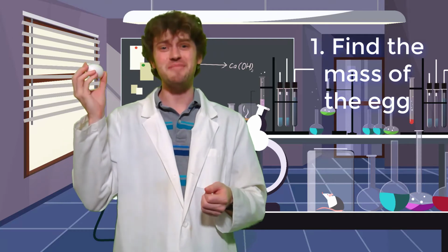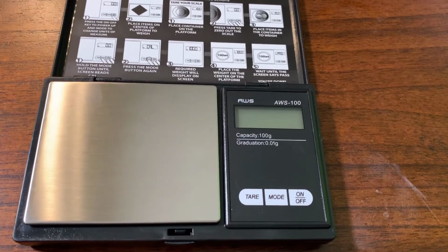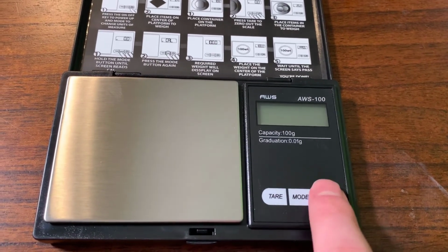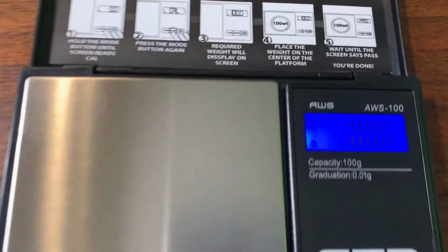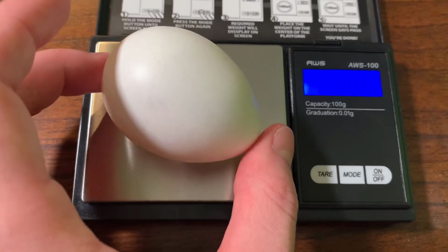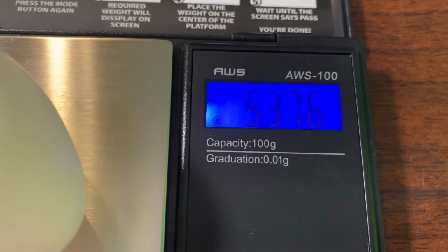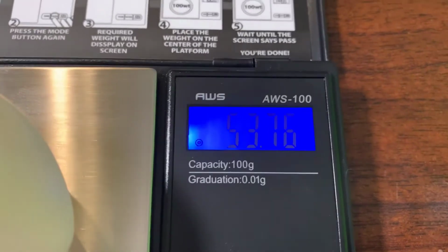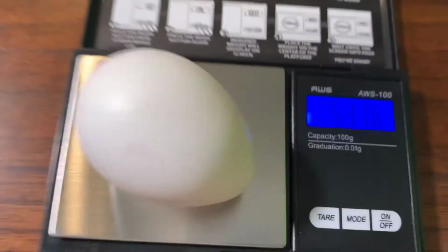First, let's find the mass of the egg. So here I have a scale. First thing that I am going to do is turn my scale on, and we should see that it reads all zeros. And then I'm going to put my egg on the center of that scale, and I'm going to take that reading. So this egg has a mass of 53.76 grams.